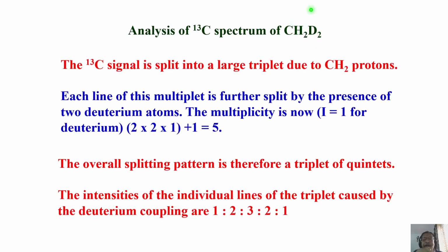Now carbon-13 is in natural abundance here. Assume that abundance is small and it is not going to split this deuterium. So what are we going to get? This is split by two equivalent protons into a triplet. It will become a triplet. That's all. Now all three nuclei we can study here, and we can generate the multiplicity pattern. This is how we can analyze the spectrum of even a small molecule with several nuclei present.